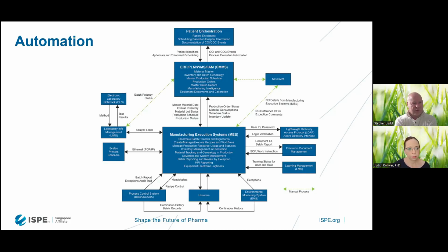And when it comes to the discussions around decentralized versus centralized, that would be with respect to autologous. With respect to allogeneic, it would depend on the process, because some allogeneic processes would still be relatively small scale, and donor batches would be relatively small for each donor harvest, and therefore you'd still be looking at that possibly decentralized model.